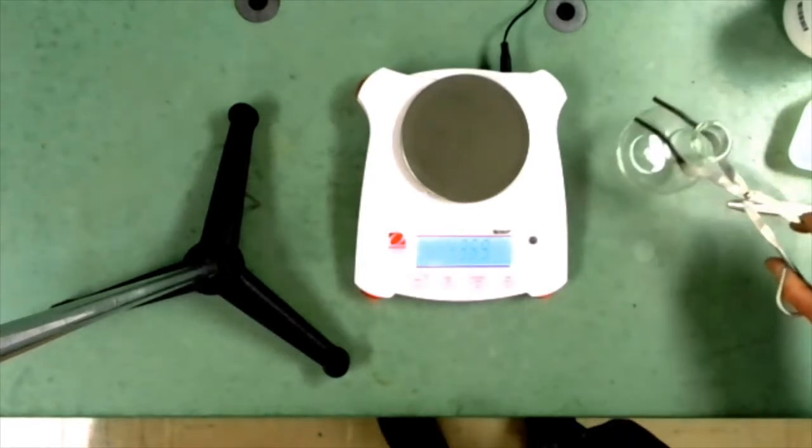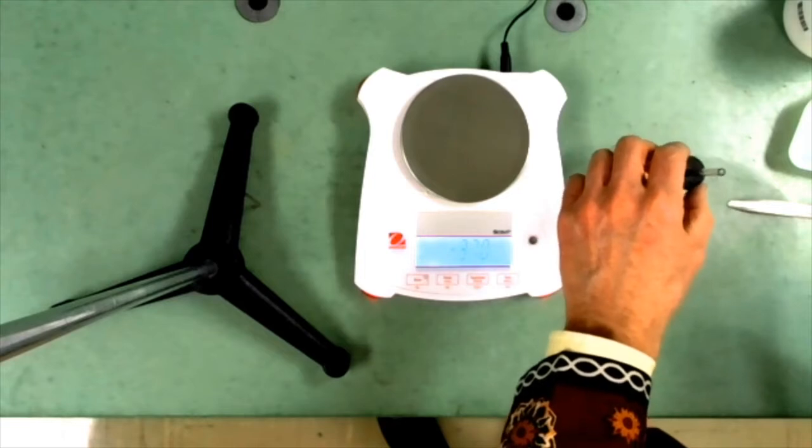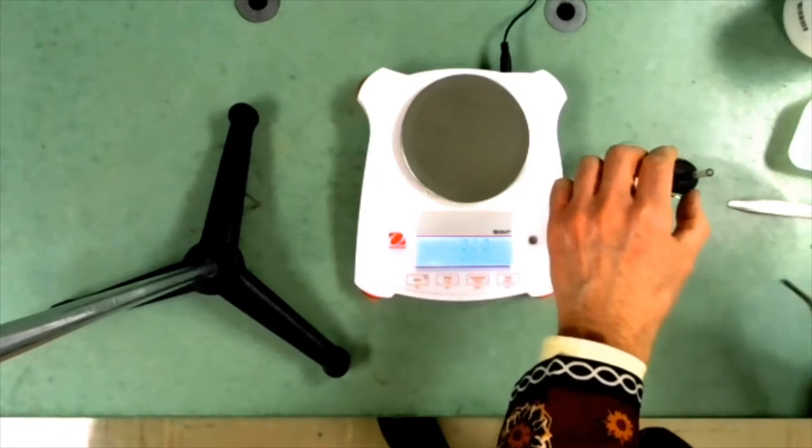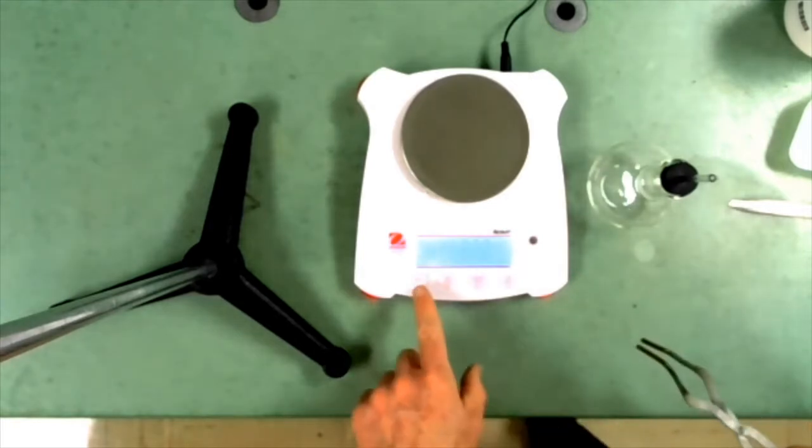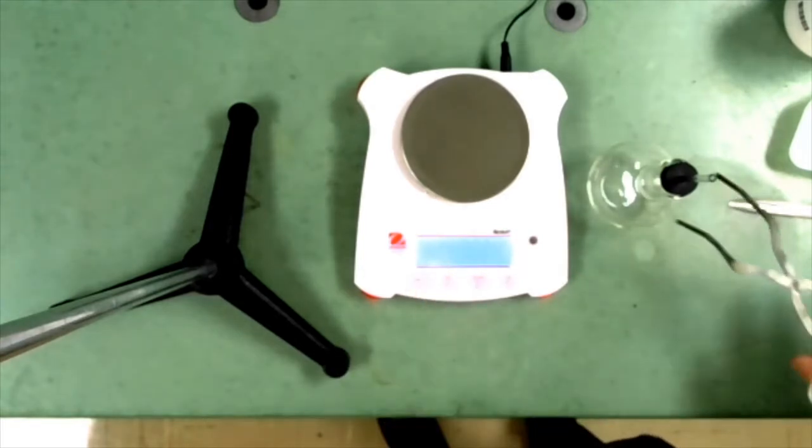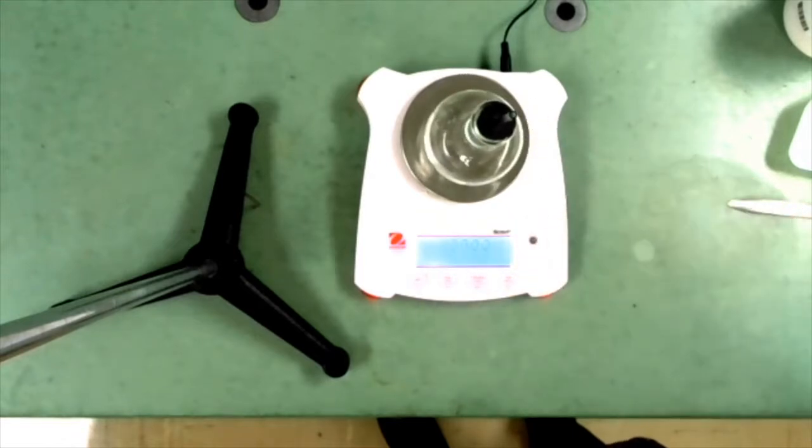Next, to weigh our receiving flask. I put the stopper in. There's no point putting it in tightly because we don't want it in tightly. I need to zero the balance. 127.93 grams.